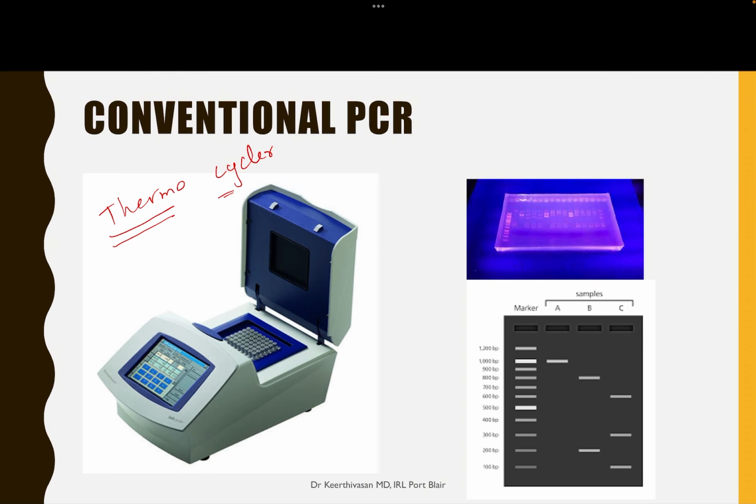One of the techniques is gel electrophoresis. Here, based upon the weight, whatever DNA we have amplified will be spread on this gel. Then, using UV-based dyes and UV rays, we irradiate it and get a picture. Then we use a marker scale, like you measure something with a scale. Like that we have a DNA ladder or DNA marker, to tell which area these bands have moved to and what weight that particular product will be.